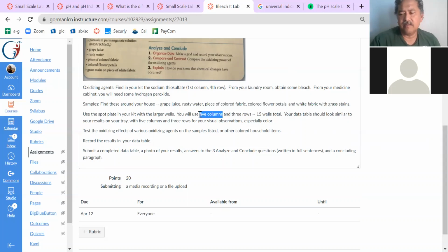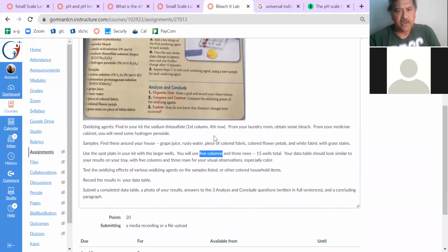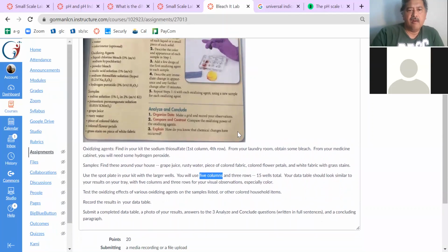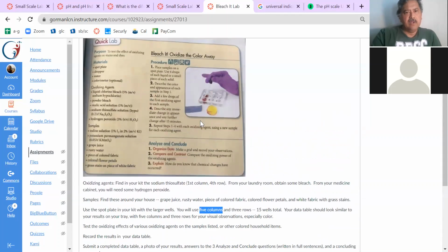Each of the columns, remember, columns go up and down like a column holds up a roof. You need 3 rows. And what are the 3 rows for? What you're going to do with those 3 rows is add the oxidizing agent. So you're going to add some bleach, some sodium thiosulfate, and some hydrogen peroxide. And then when you add those, record your results. You're going to make a table yourself and then record the results. Hopefully you're able to take a photo of your results as well, and then just answer these 3 questions right here and write a concluding paragraph, just like we've done all year.